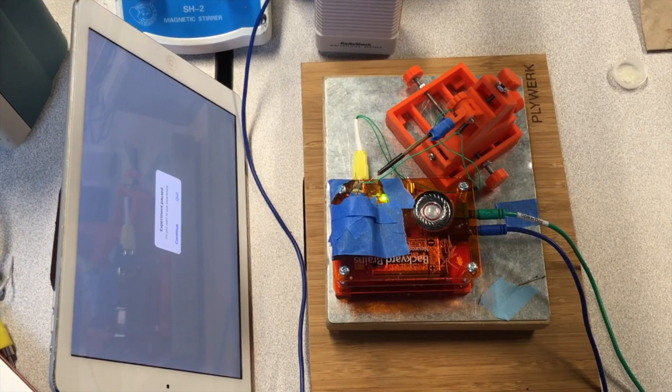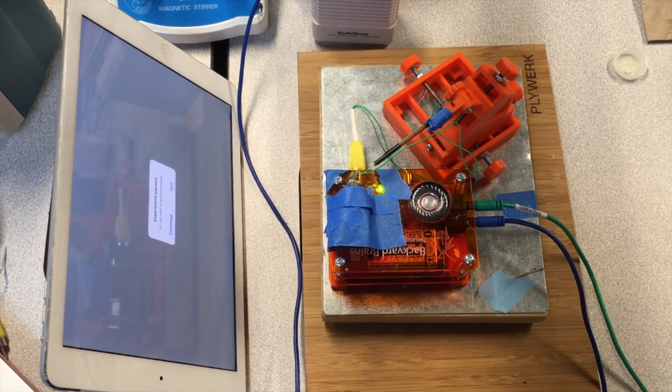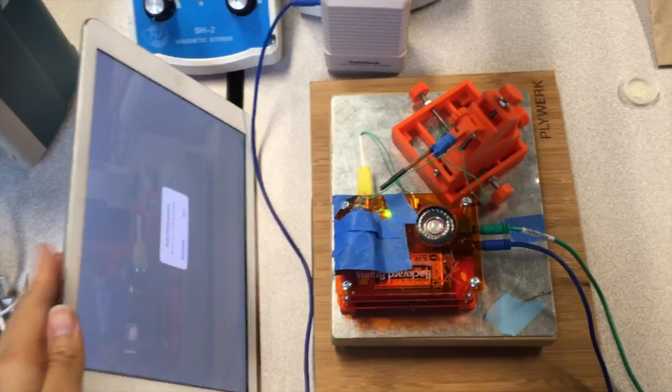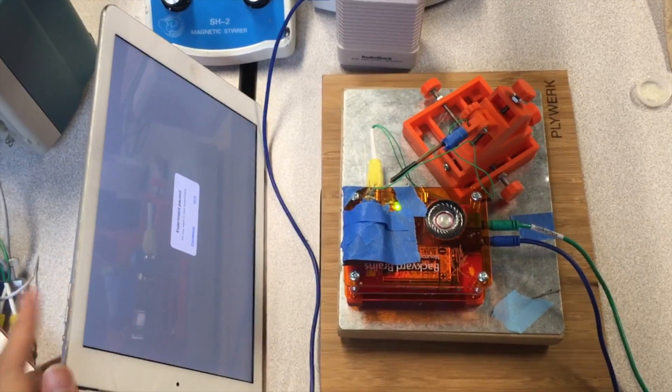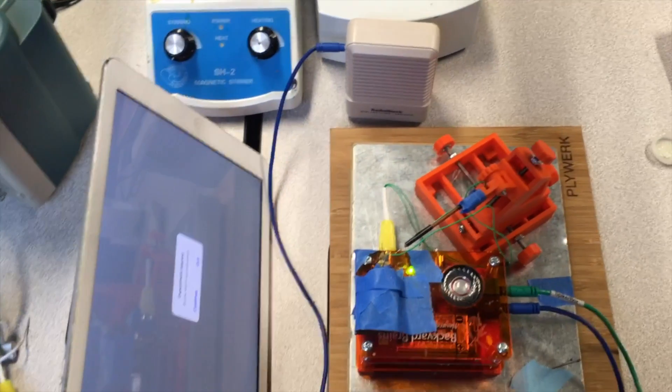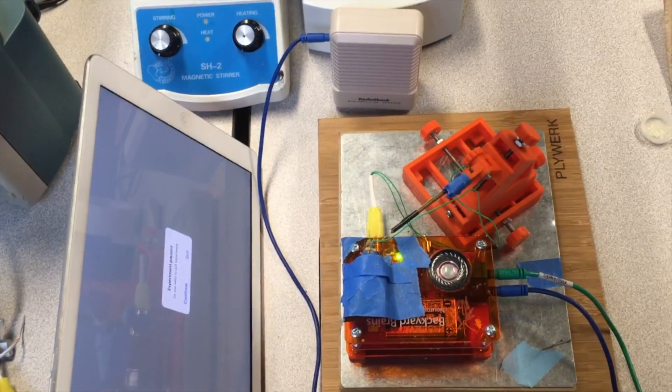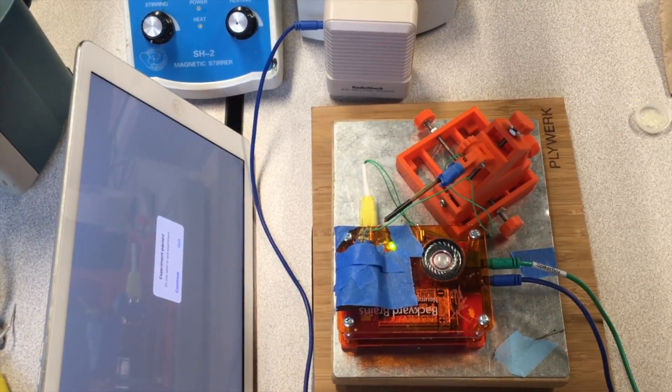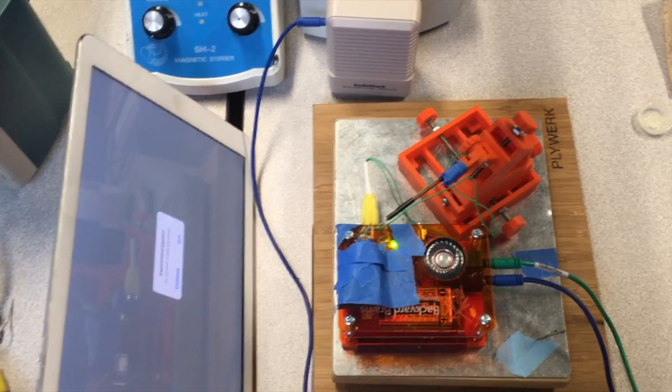Now that the prep is done, we can begin the experiment. I'm using the iPad Spike Recorder app to record the DCMD activity, and we can also listen to it using the Radio Shack speaker. On the screen, there will be black balls expanding to simulate an object approaching the grasshopper's eye.